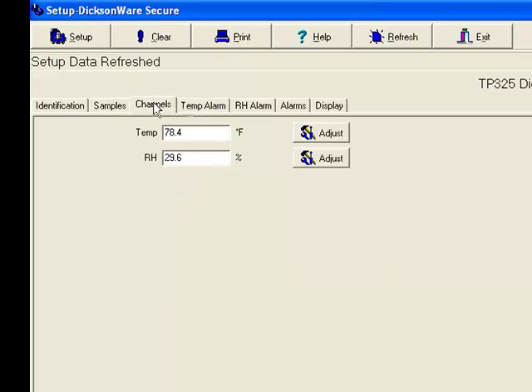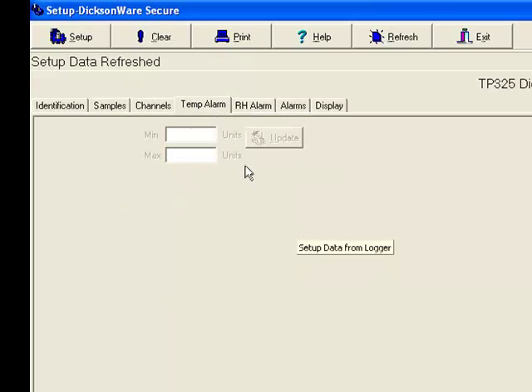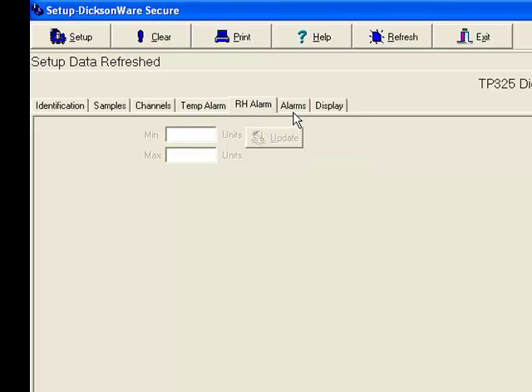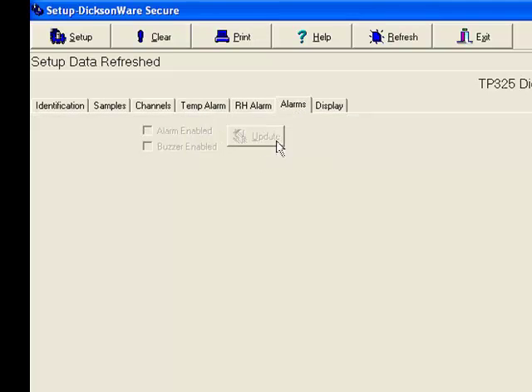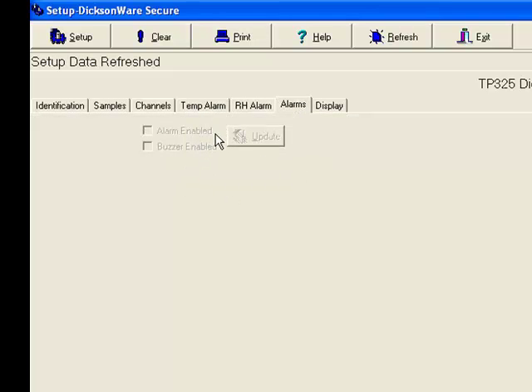On other models, you'll notice that you can set alarms. On this model, you can't. This one's strictly for recording. You can enable them, and you can enable the visual or the buzzer.